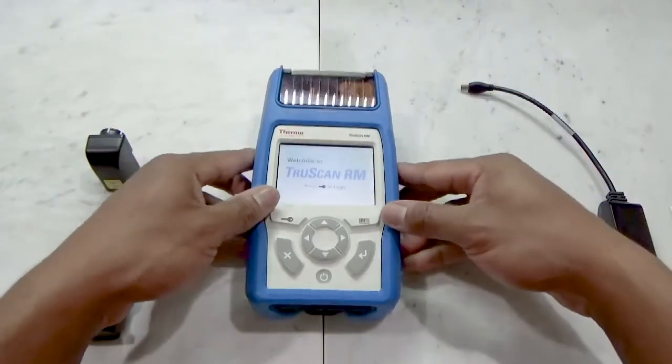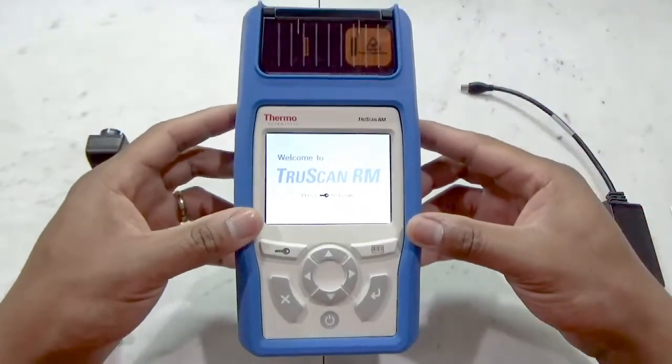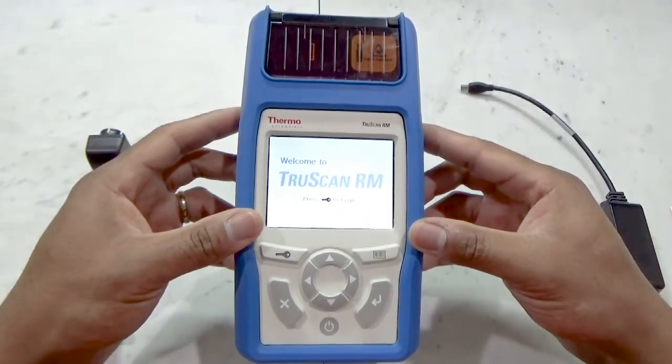This video provides a quick overview of the TruScan RM handheld Raman Analyzer and a few of the accessories for the system.